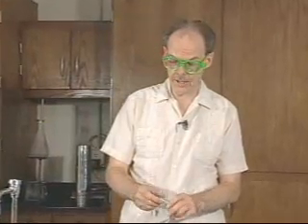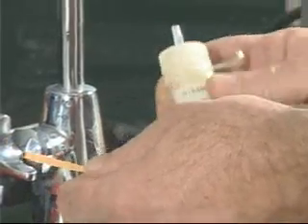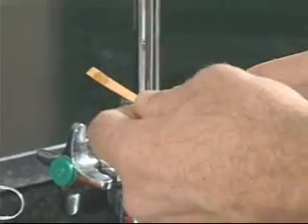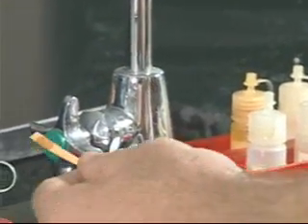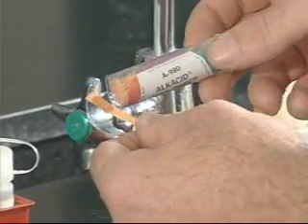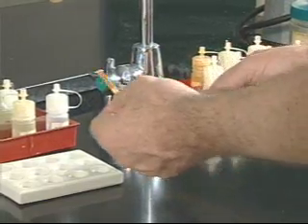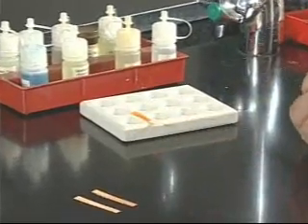Now our first test — we're going to do three tests as examples. The first one involves the use of pH paper. This pH paper is colored and can change color in response to certain kinds of reactions. Some standards may have no change whatsoever. Place on the pH paper one drop of one of your standard solutions, and then compare the color that you see there with the color on the vial containing the pH paper. As you can see, this doesn't have any significant color change, which means that it doesn't have any acidity associated with it. Be sure to keep the chemicals off the table and lay it down in an appropriate location, perhaps on the spot plate.